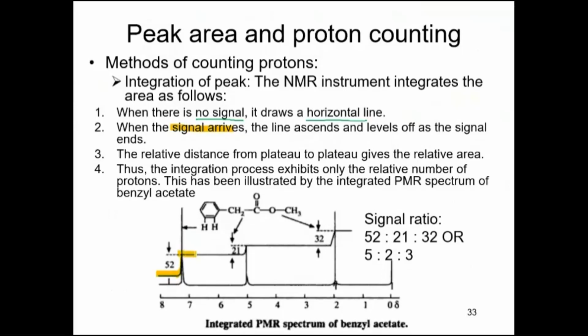Again there is no signal, so there will be a plateau region. Another signal arrives, again it is rising. Again no signal, again there is a signal, so again it will rise. So the question is how to decide how much it is rising.